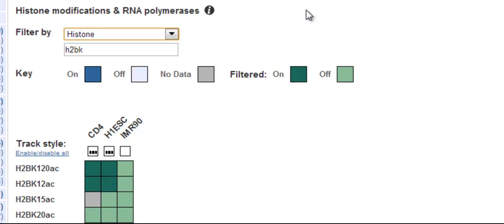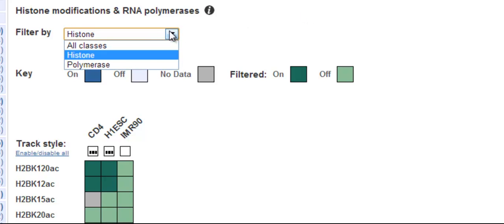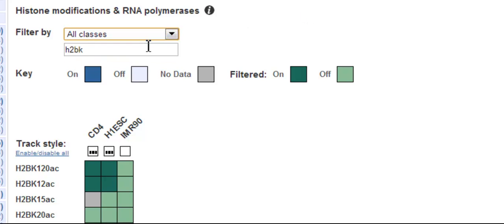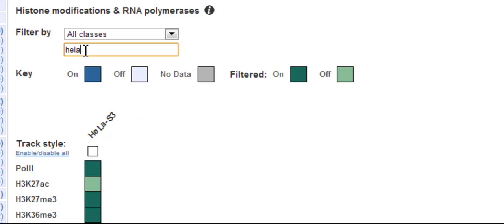A bit of advanced search functionality. If you search for a term with a space in it, for example, HeLa space H3K, you get cells which match both of the terms, HeLa and H3K.